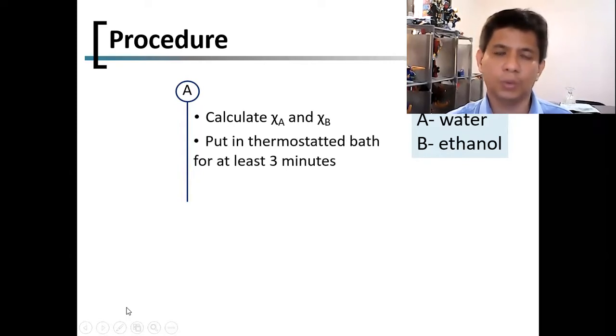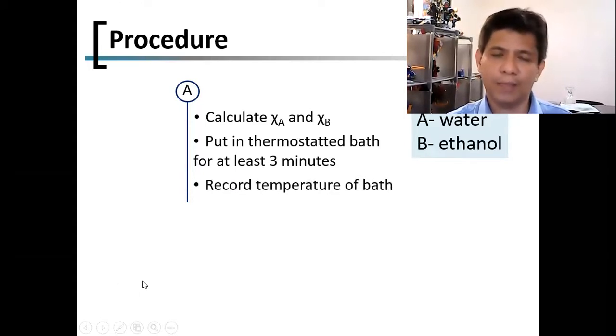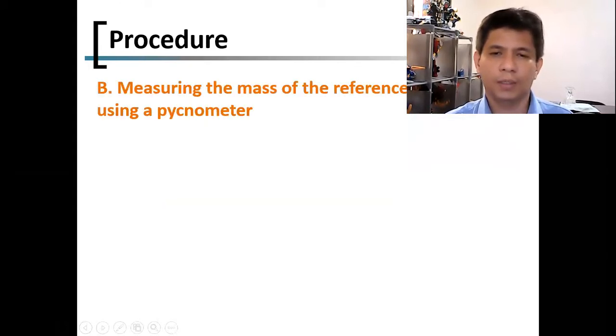You're going to put this in a thermostated bath for at least 3 minutes before proceeding to part B. And then record the temperature of the bath. That's the end of part A, so let's go to part B.